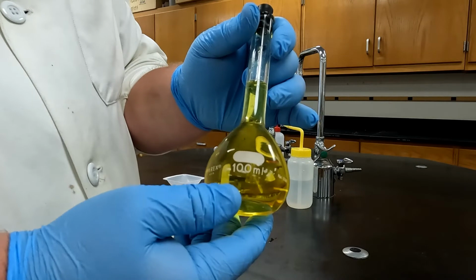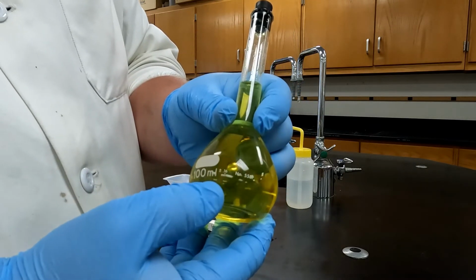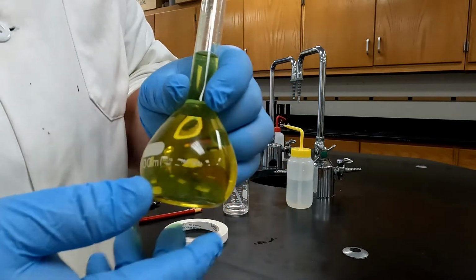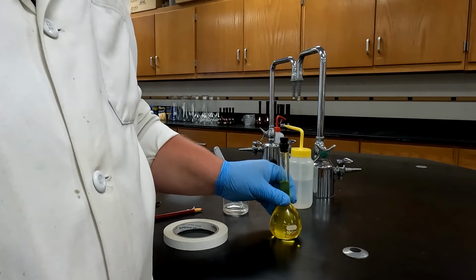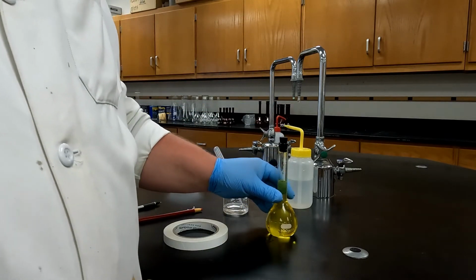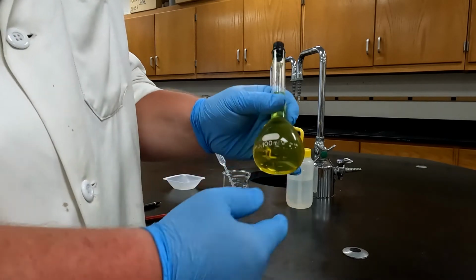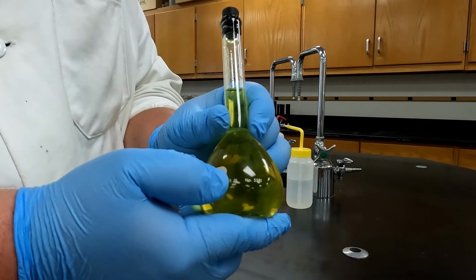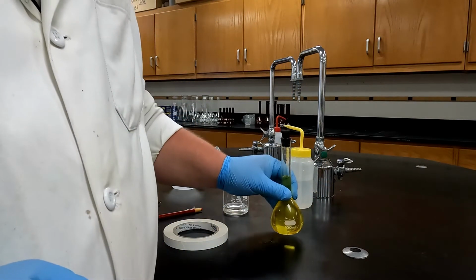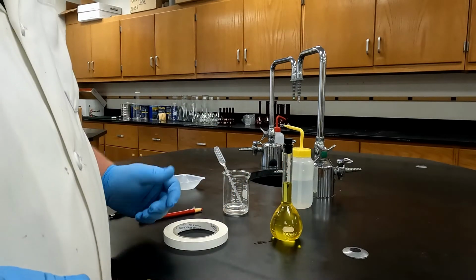When I look at this flask, I see that it's a 100 milliliter flask. And then just to the right, there is a very small plus minus. This tells us the error of the flask. That first digit there, we're going to assume our significant digit is to the first digit of our plus minus. This one is plus or minus 0.16. It's kind of hard to see in there. So I'm going to assume this is 100.0 milliliters in this flask.